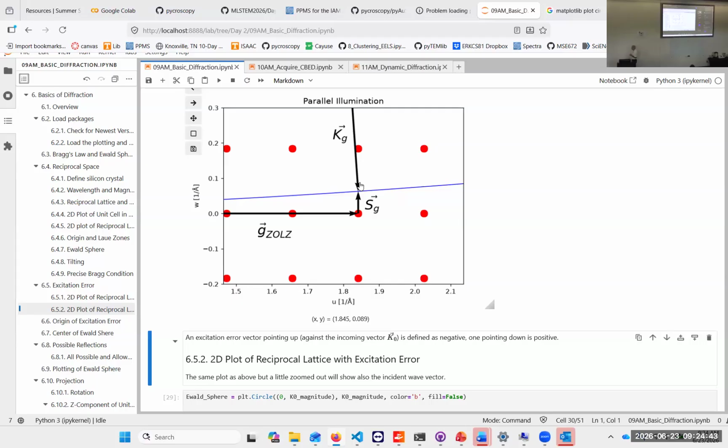And we go a step further. Everything we find complicated, we can blame on this excitation error. So this excitation error not only has like a stick, it actually has different, it's more wobbly. So it has actually periodicities to it. And so this excitation error is where there is additional information in an electron diffraction pattern. So we blame everything on the excitation error.